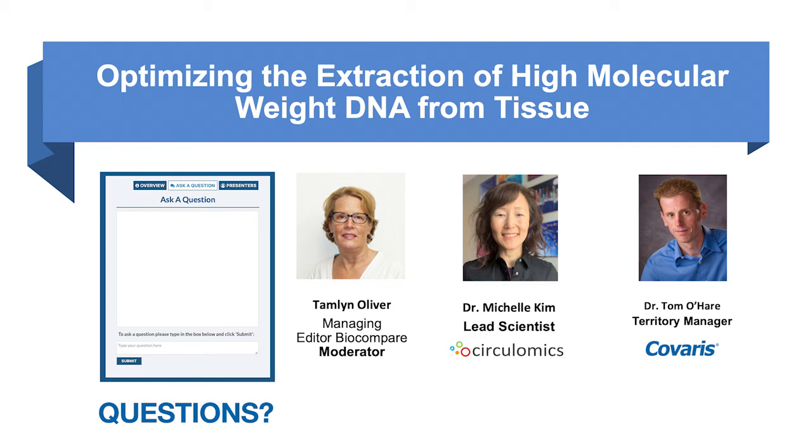Okay. Is there a detrimental effect to storing samples at minus 80 degrees after cryoPREP? To my knowledge, there isn't. In fact, we have tissue samples that we have gotten from customers or collaborators that they've themselves had in minus 80 storage for, I think, unknown amounts of time. It could have been a decade. It could have been longer.